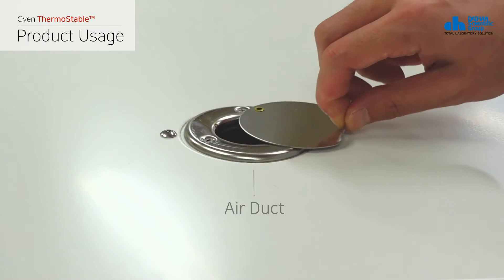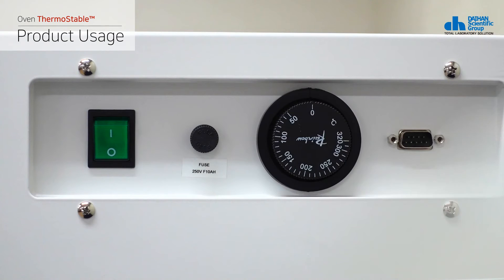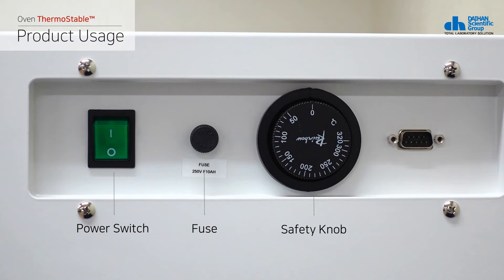The product's main body has an air duct at the top, which you can use to control the air circulation volume in the chamber. On its right side, it has a power switch, a fuse, a safety knob, and an RS-232C port.